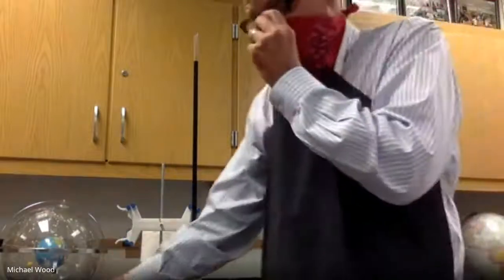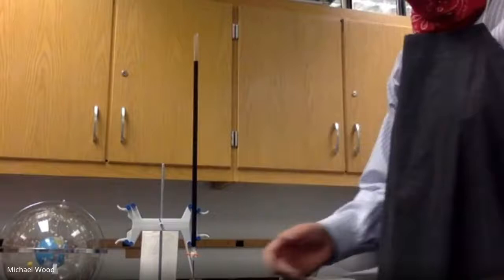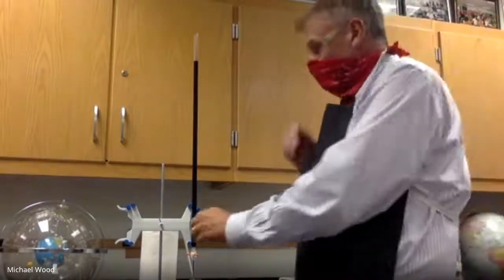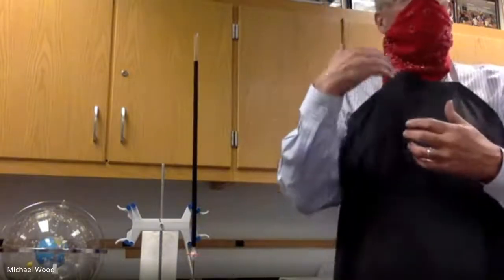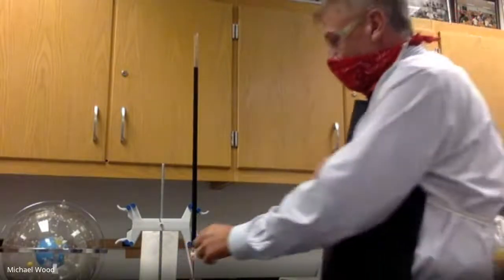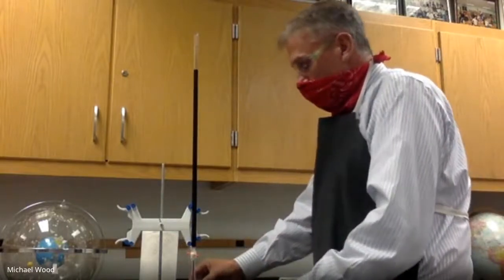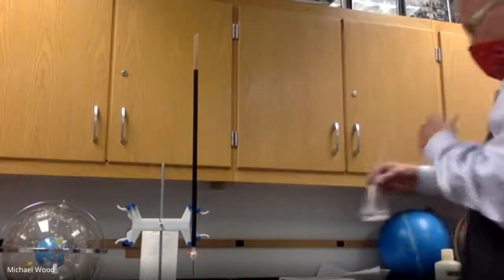I know that I did this period 1 before I had class, and then I did this in period 2. It's going to take about 25, at least 25 mLs. If you're doing this the first time, you would just add a little squirt at a time, and it would take you a while to do. But because I've done this, I'm just going to add, whoops. Oh, there we go. It went away.